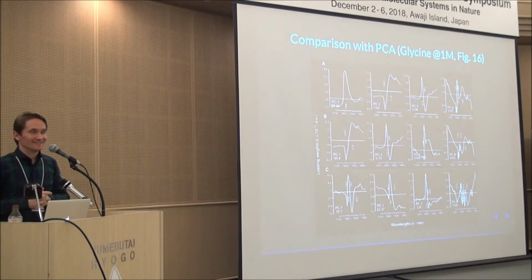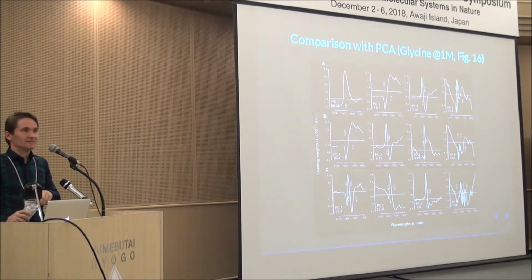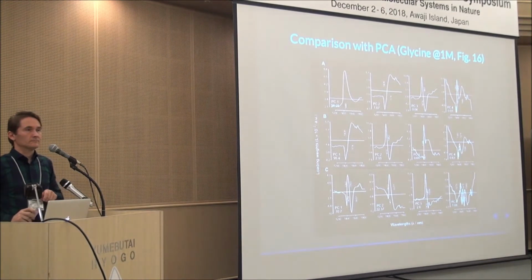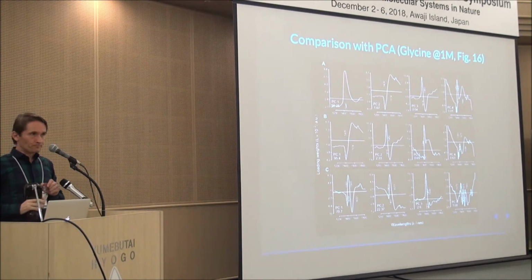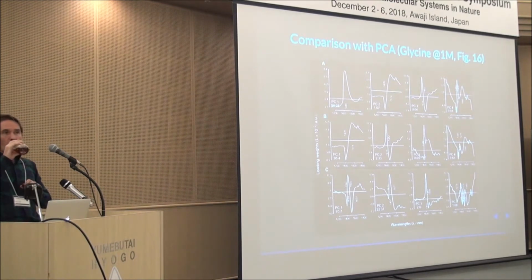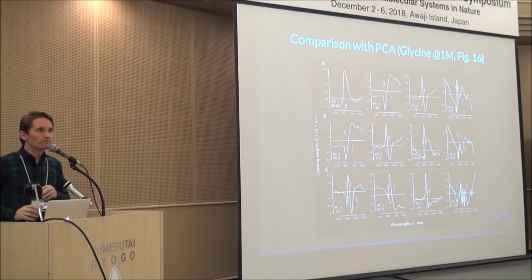Hello. Thank you very much for your presentation. I'm really looking forward to trying this out. I also tried something that I read in a paper of Eva Gowen, and she used EMSC, and then she said to use the first regression factor of the first PC to correct for temperature in your data set.